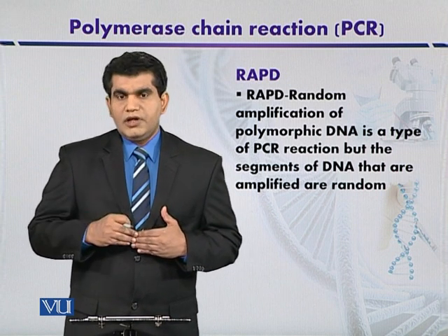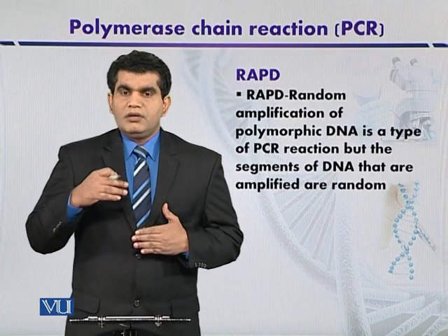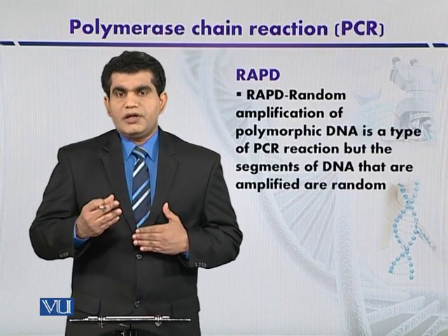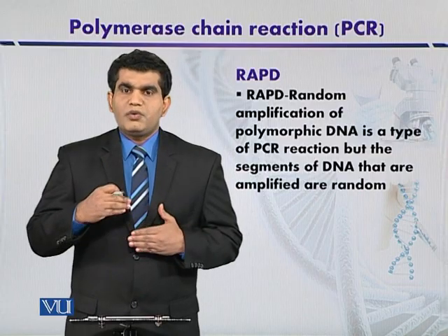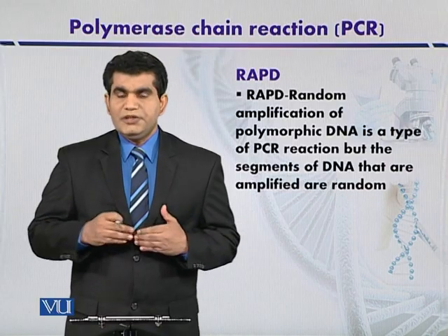And third, and the most important limitation, is that RAPD cannot show reproducibility of the results. So reproducibility is sometimes missing.